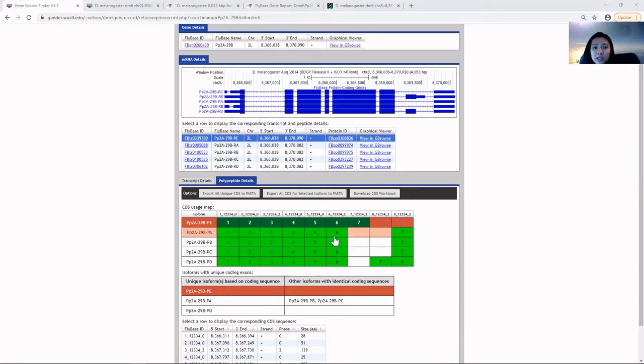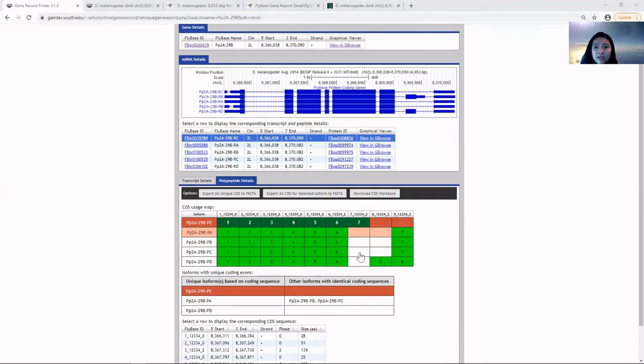The difference between these isoforms lies within the last terminal exons in terms of protein sequence, indicated by the polypeptide details tab.